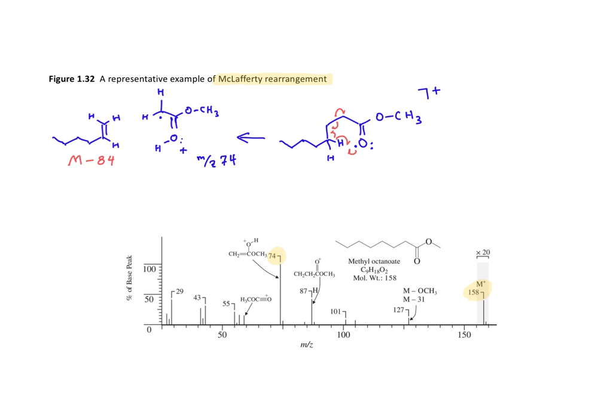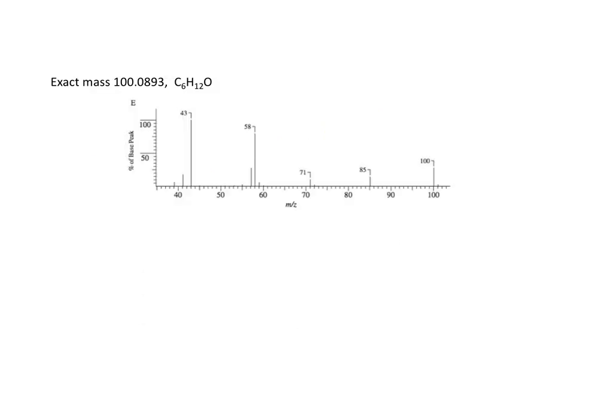I'll work a couple of problems to show how we can identify some substructures. For this problem, from the exact mass data, a molecular formula of C6H12O is determined. If necessary, review the index of hydrogen deficiency on page 15, which I tend to call the unsaturation number, UN, in this case equal to 1, consistent with either a pi bond or a ring.